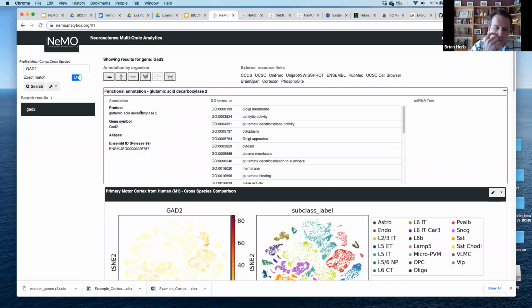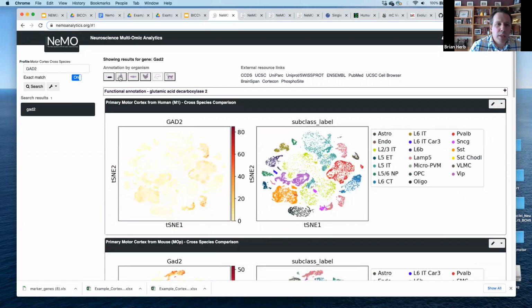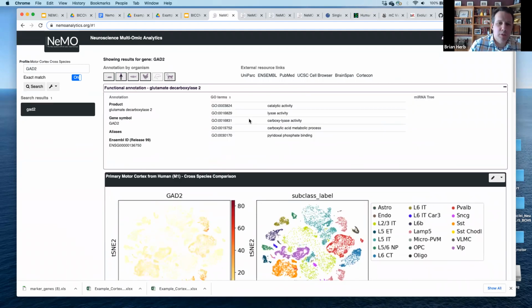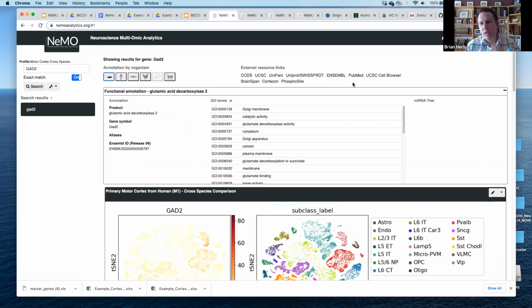So a bit of what GO categories it's associated with, and maybe a little bit of description in some other guys. And if you wanted to get, for example, human-specific information, you would click on the different icons, and then the drop-down menu gives you a little bit different information based on what is known in human or the other species. We also have a series of link outs. So again, these are going to be based on the gene itself.